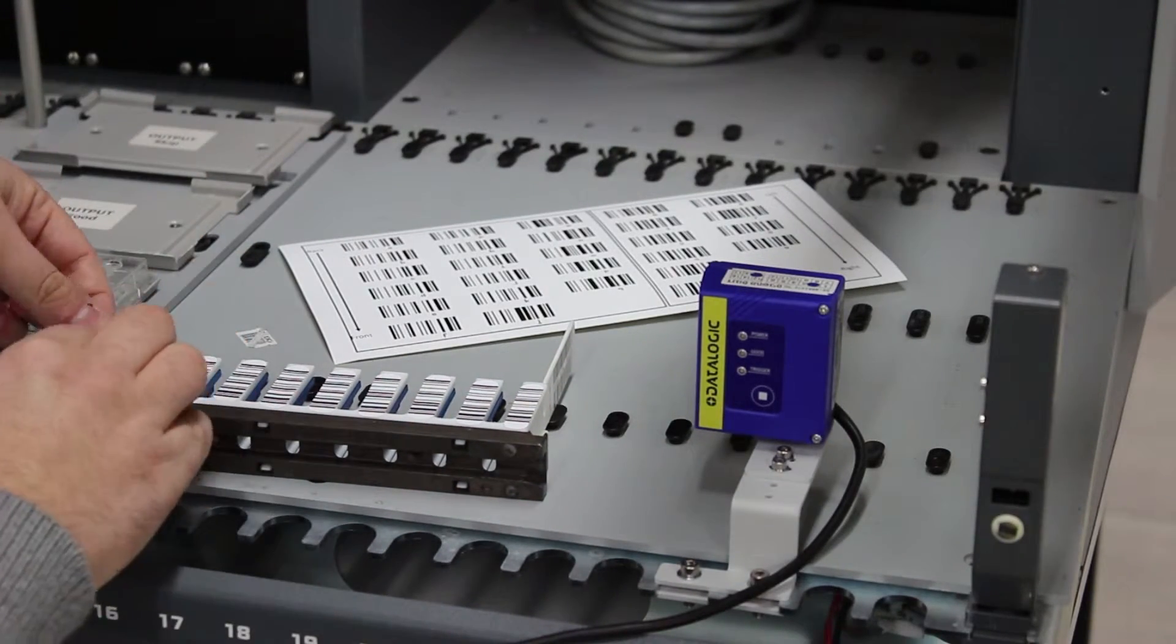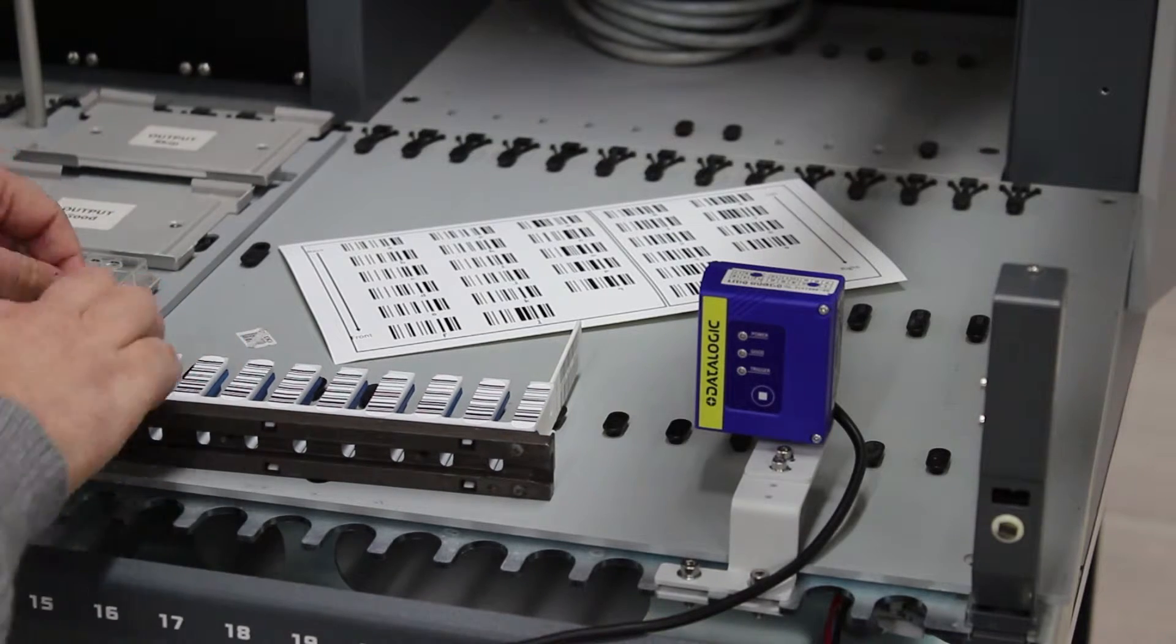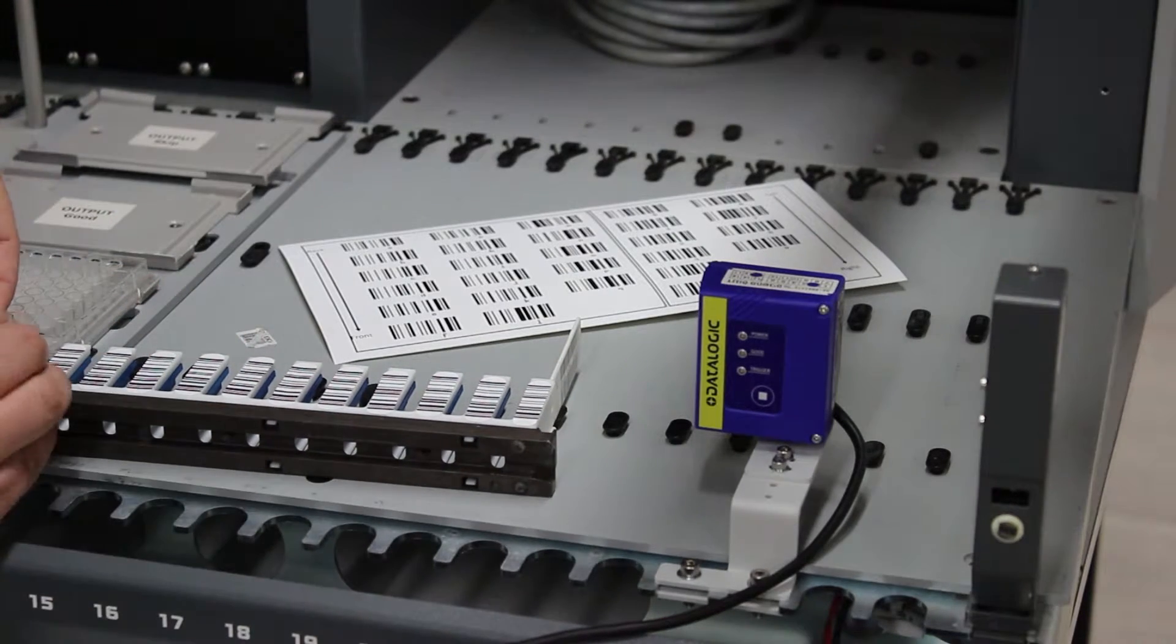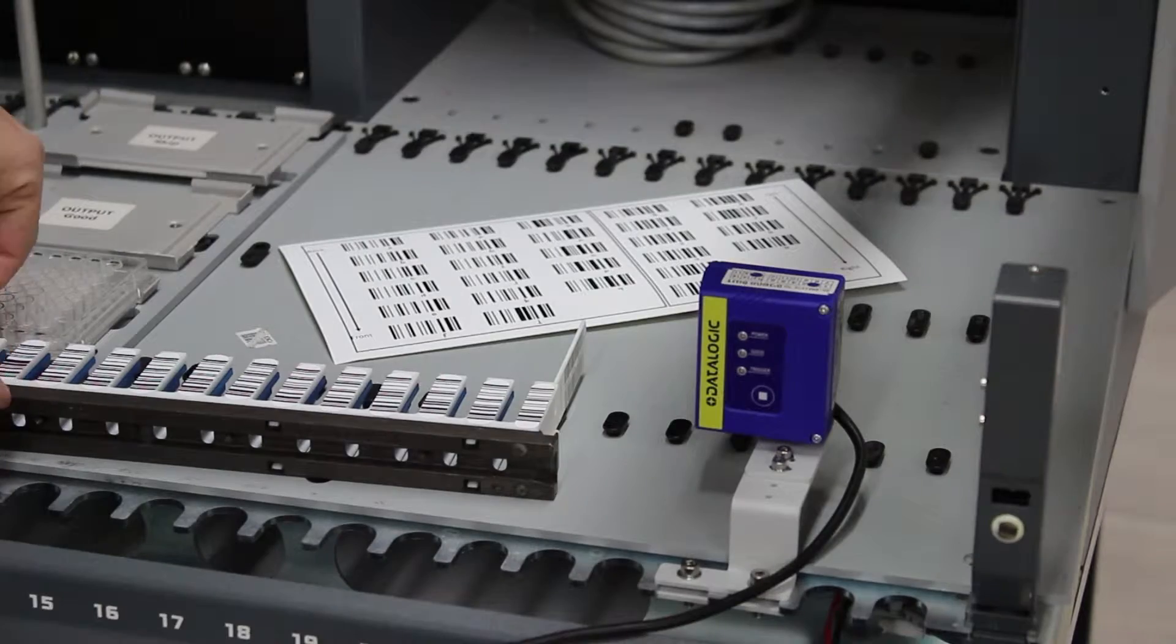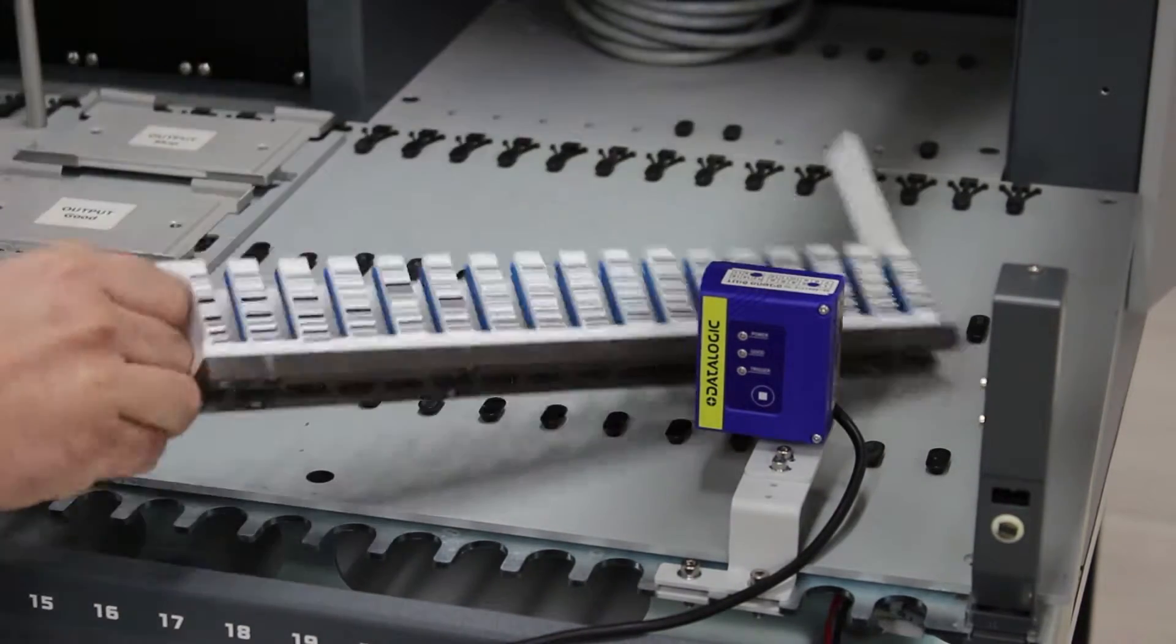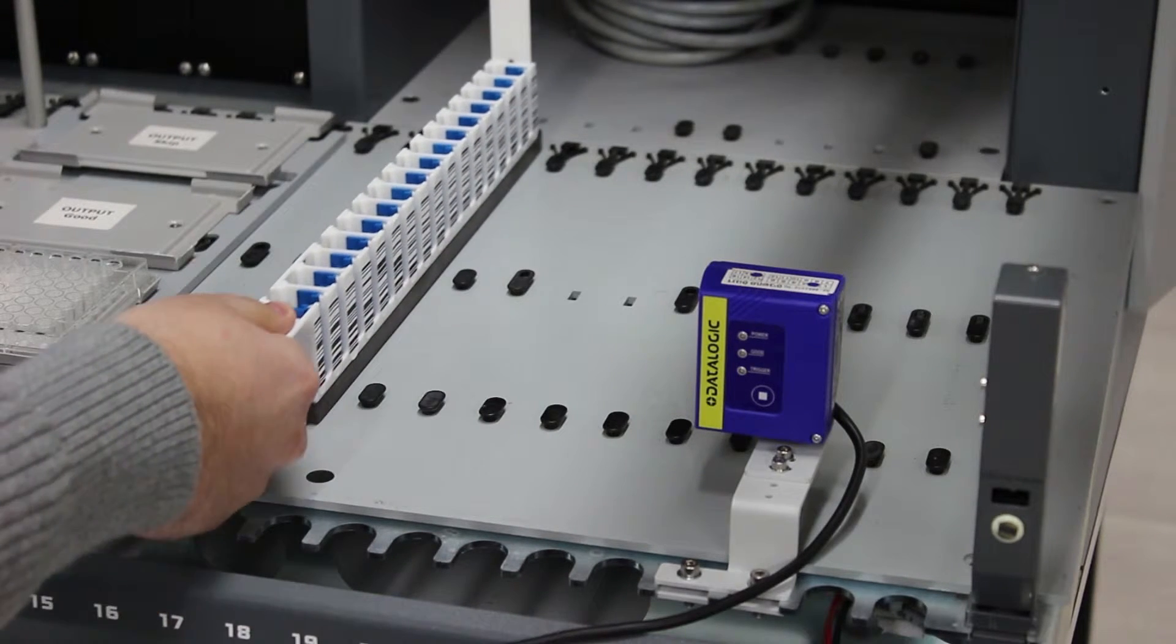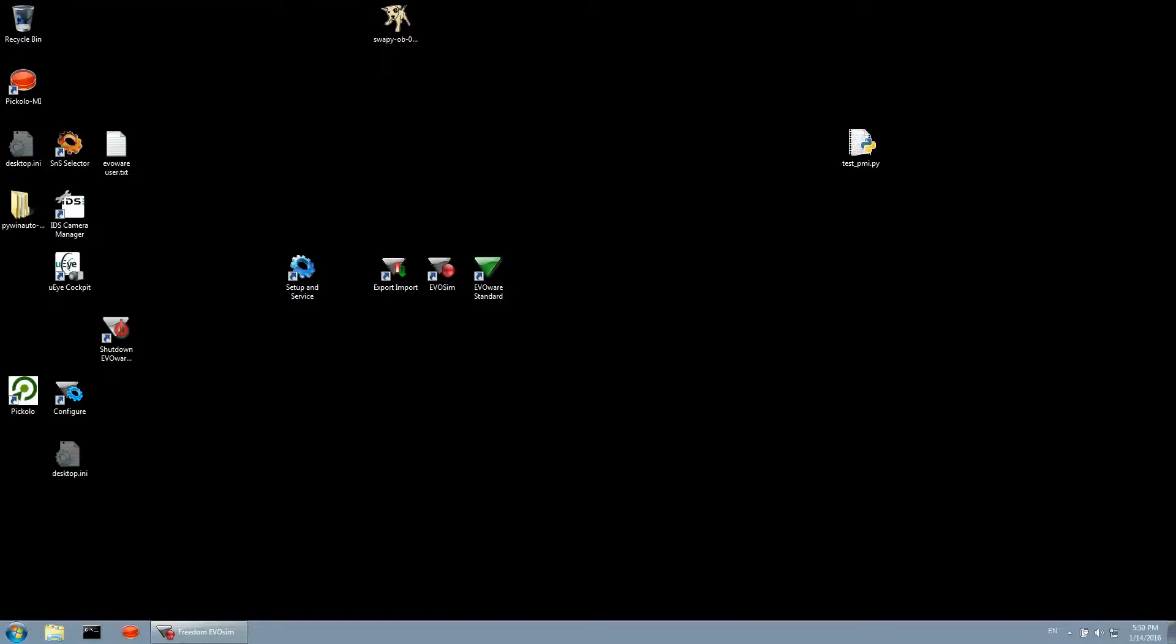Continue with the rest of the stickers, with a sticker labeled Q attached on the position closest to the user. There are a total of 12 sticker pages for labeling up to 12 tube racks.